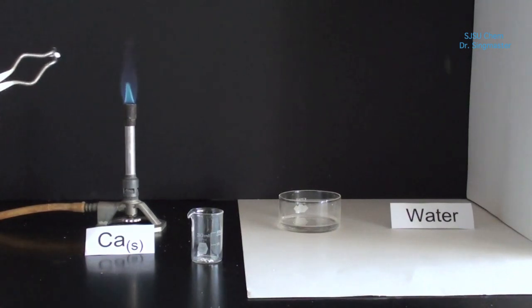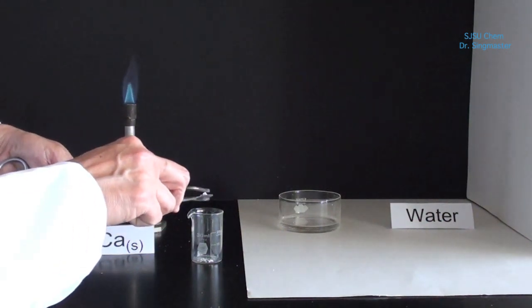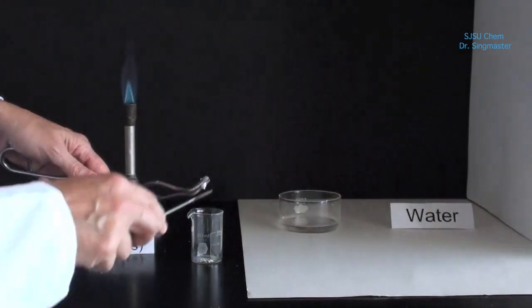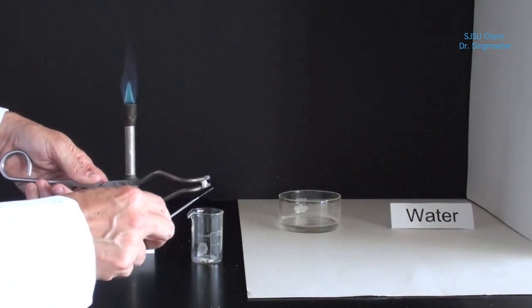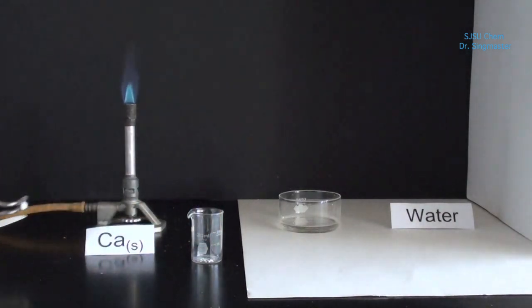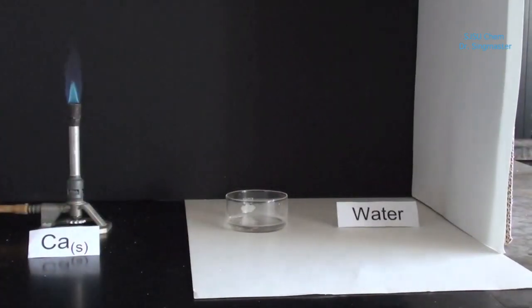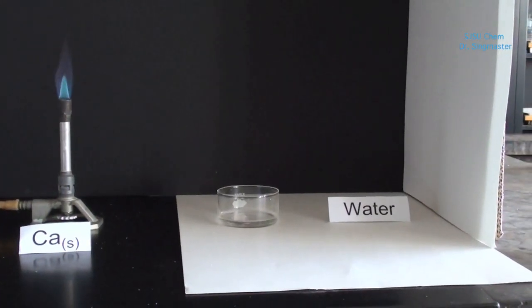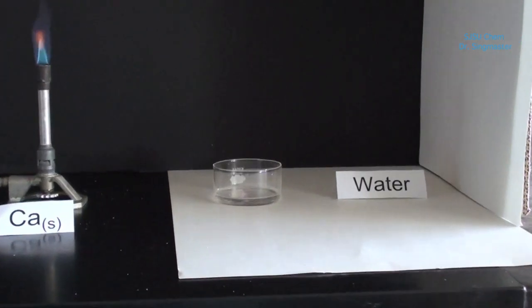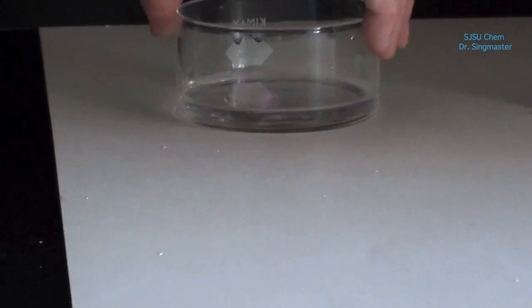Now some of that white material is going to get scraped into the beaker. We're going to put that material inside the water and mix it a little bit.